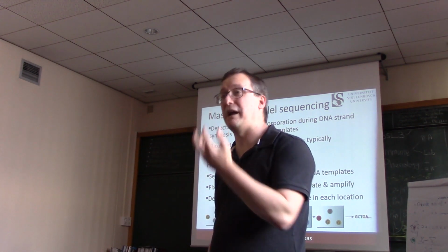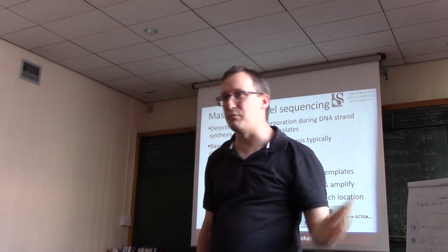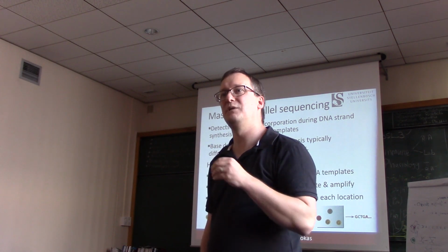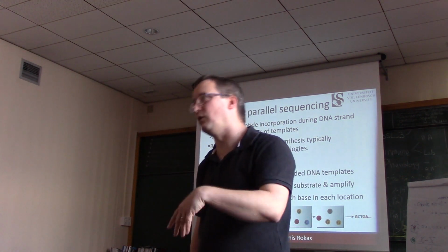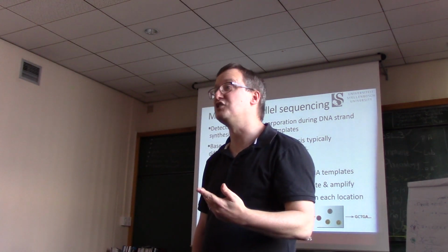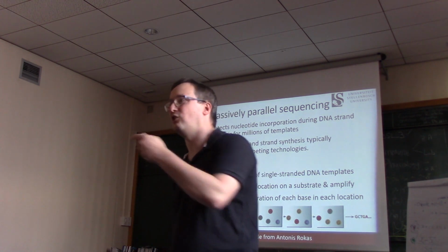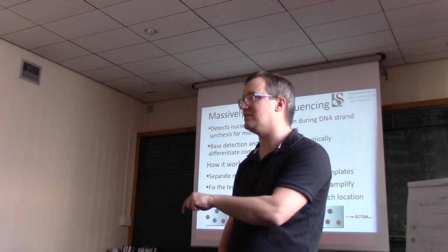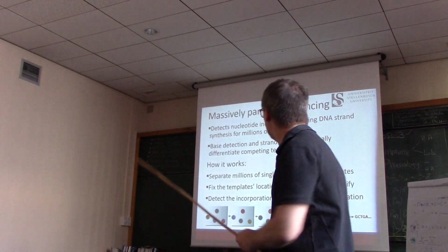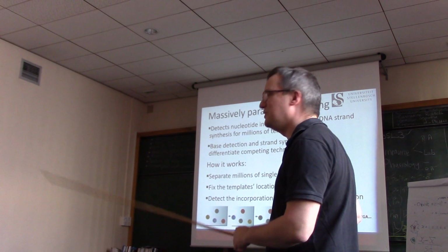They are massively parallel sequencers because you're sequencing a tremendous number of templates all at the same time. We're no longer limited to being able to do 96 or 24 or 384 different sequences at a time. We're able to do millions of sequences. Millions of different templates are all getting sequenced simultaneously in each run of the experiment. That is pretty remarkable. So I want to remind you of how cartoons work, right?